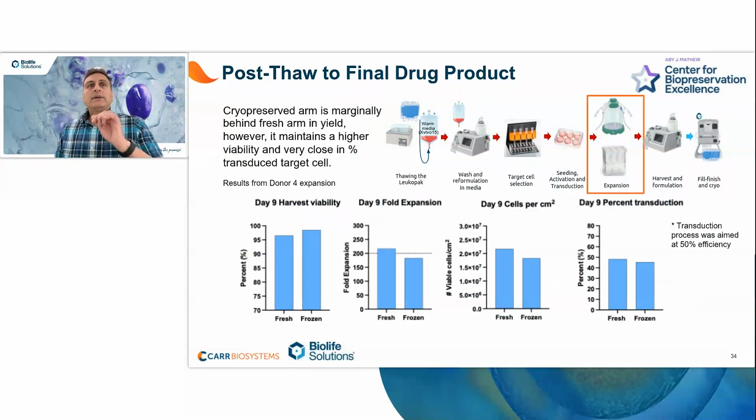Now, looking deeper into the data from day 9 of the process, as I mentioned, the goal of the study was to understand whether the initial cryopreservation of the product has any impact on that final drug product, distribution of the cells, expansion yield, transduction efficiency.